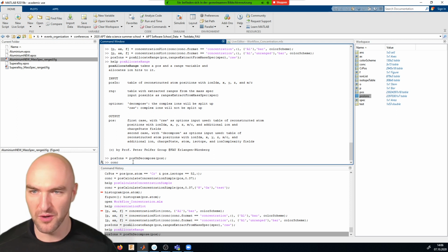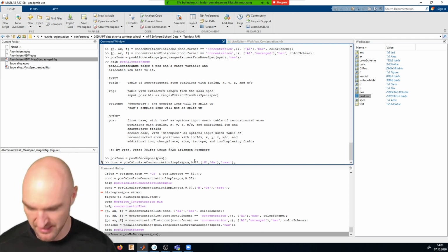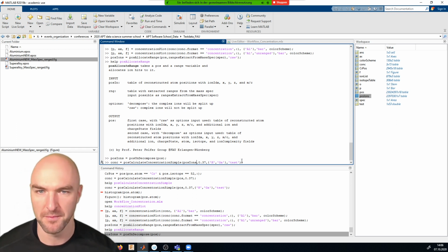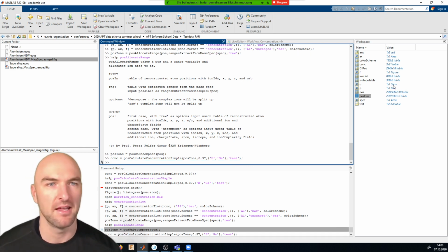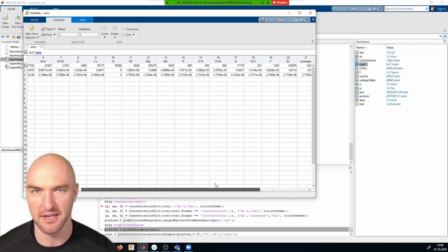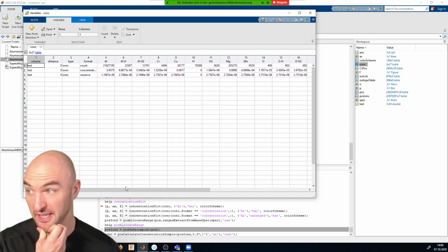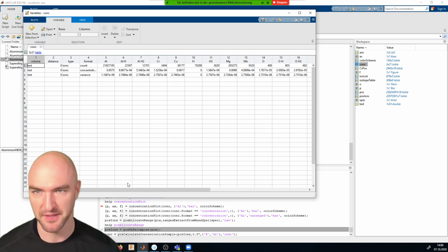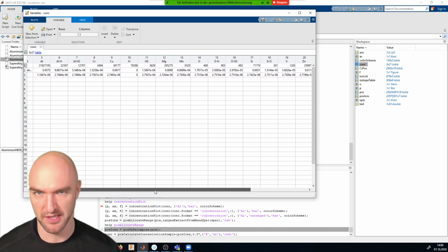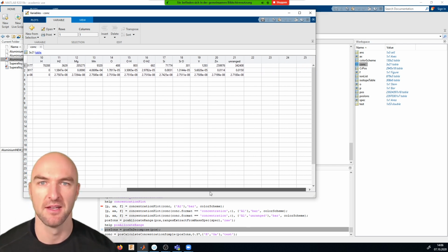And now I can go, concentration is concentration calculation, and I use the pos ions variable, and if I do that concentration, you will see that we now have everything sorted by ions and not by elements anymore. This is obviously important if you want to do basic atom probe research, where you're more interested in which ions form where, rather than what chemical element they are.